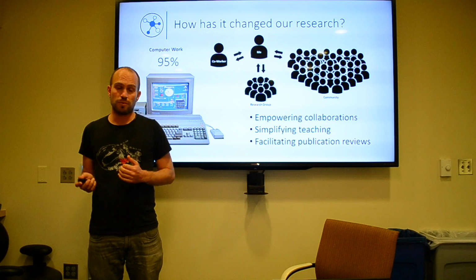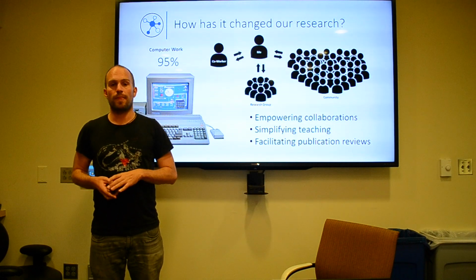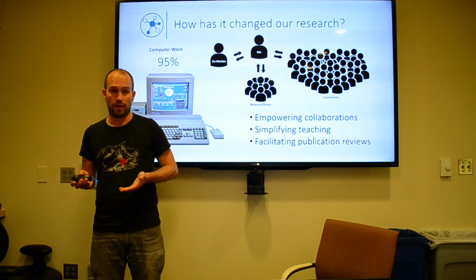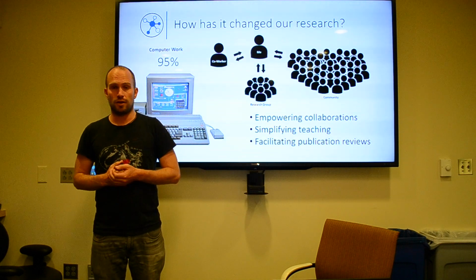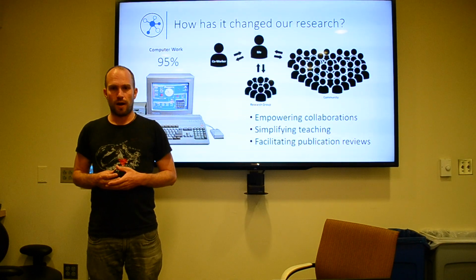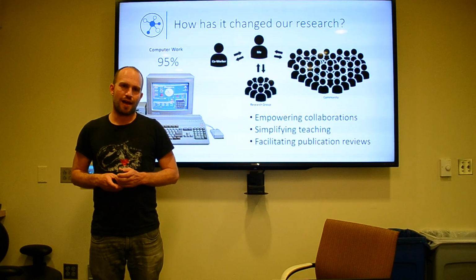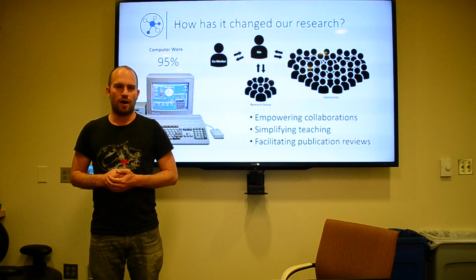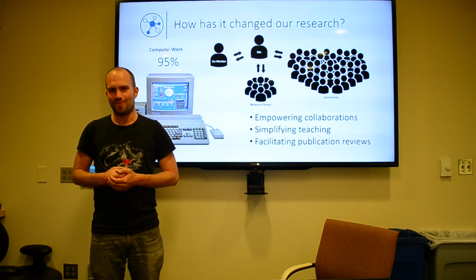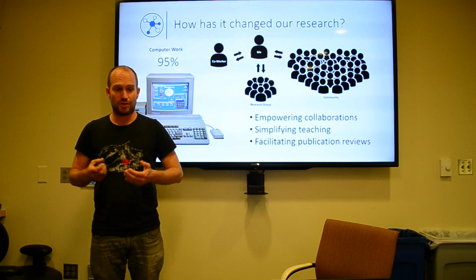And I think most importantly for myself, it really makes that data accessible during the peer review process, especially if people deposited their data in a repository. And I hope that the dashboard will contribute that way to more open science and a more transparent and reproducible data analysis of others during peer review, but also after publication.